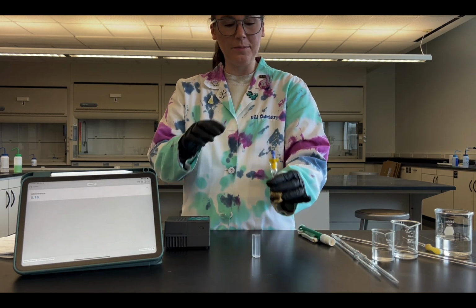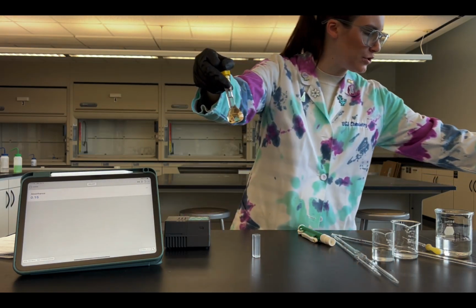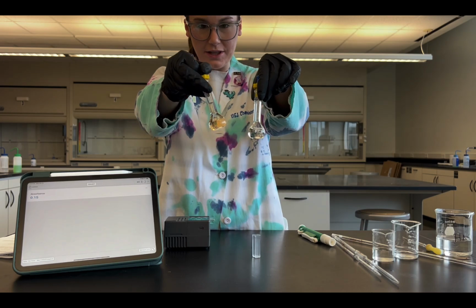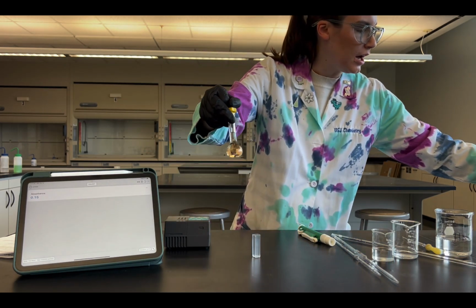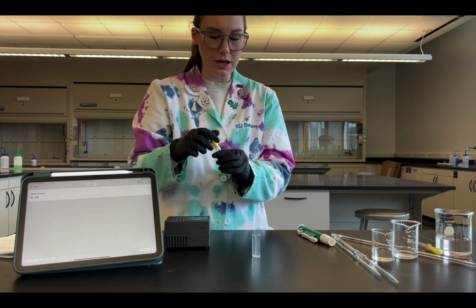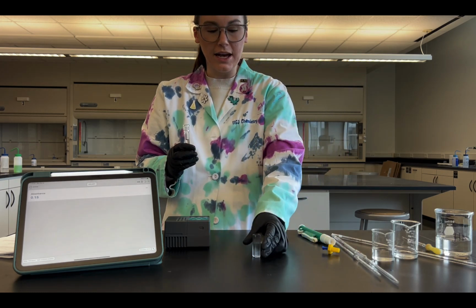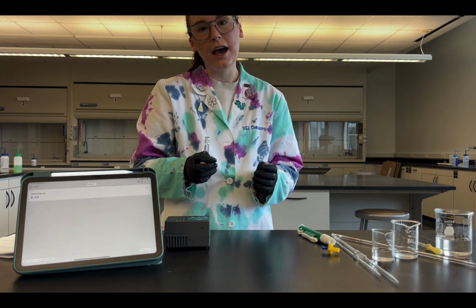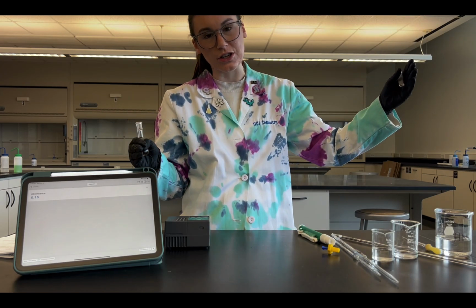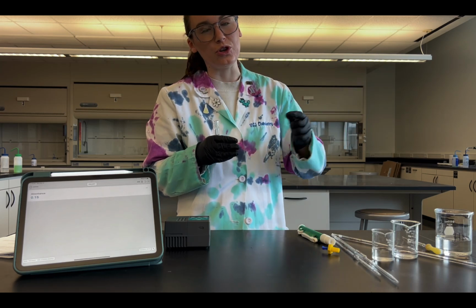I quickly went ahead and made solution 10 just so that you could see the difference in the color compared to solution 6. So this one's basically clear, whereas this one has this kind of peachy color due to the redness that the iron thiocyanate solution has, except now we're just in lower concentrations, which is why it's not as vibrant as our calibration curve. Again, our calibration curve does many different large steps in the concentrations, as we saw, so that we could find any of those concentrations given a wide absorbance range.